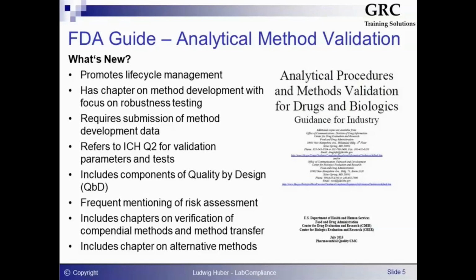This is, for example, if you don't like a compendial method, then you can develop an alternative method which may give the answer better, which may have better precision. So I think FDA is also very supportive to look at this guidance, to look at this reference material, which is also very important here.